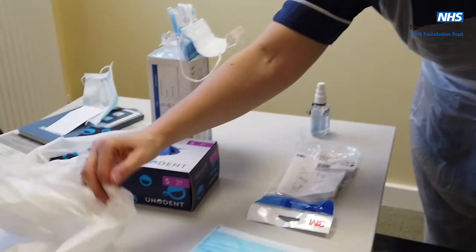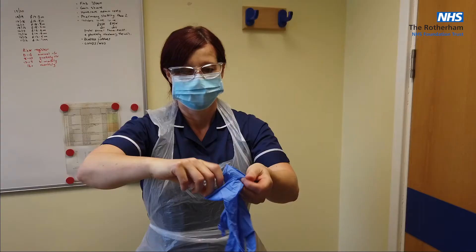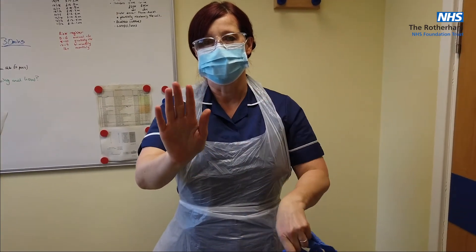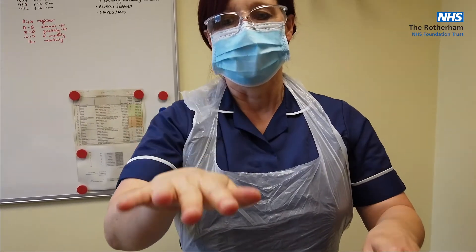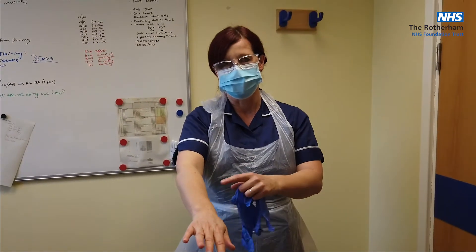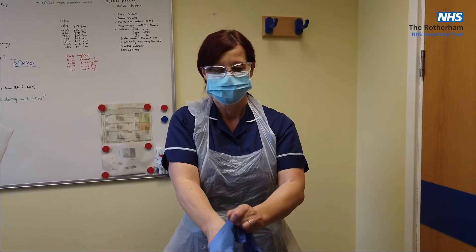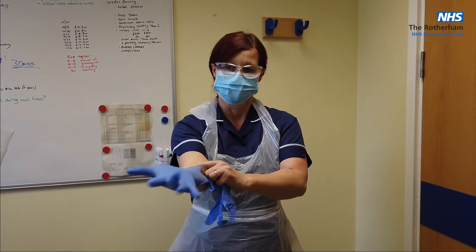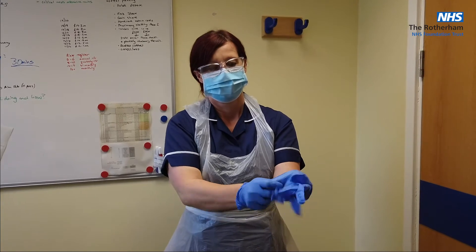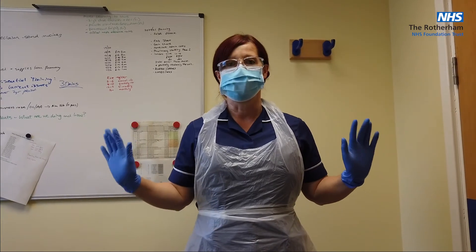And then lastly, your gloves. Making sure your nails are short — they should not be coming over the top — and you are bare below the elbows: no ringed or stoned jewellery, no wrist bracelets, watches, and no long sleeve cardigans or jumpers. I'm now donned in full standard PPE.